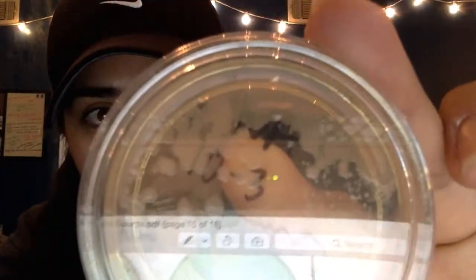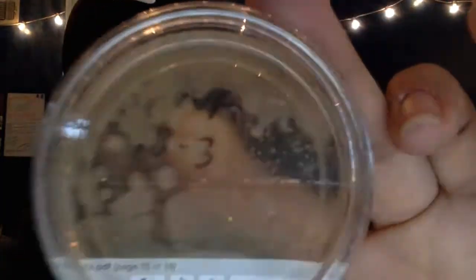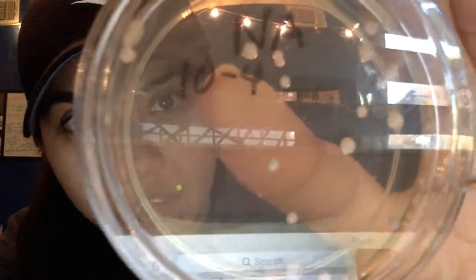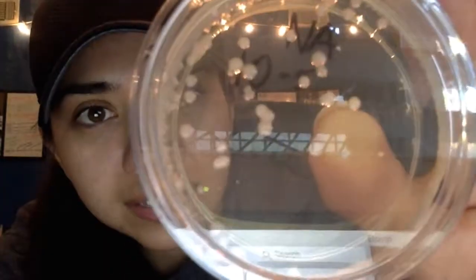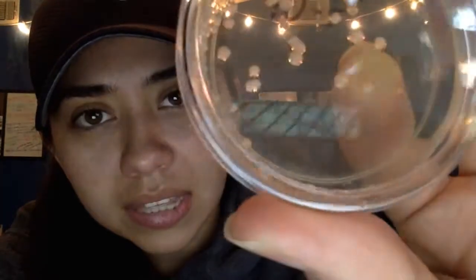Here's 10^-3. This starts to look a little more spotty, probably somewhere in between counting the number of colonies and too numerous to count. But here's 10^-4. These I can definitely count. It doesn't have that same thick filmy substance the other ones did, at least covering the majority of it. And now here's 10^-5. For some reason 10^-5 looks like it has more than 10^-4 if you look here on the sides of the agar plate. Maybe that could be because I didn't do the proper amount of liquid in this plate as I should have, so it appears like there's a couple more colonies than in 10^-4.